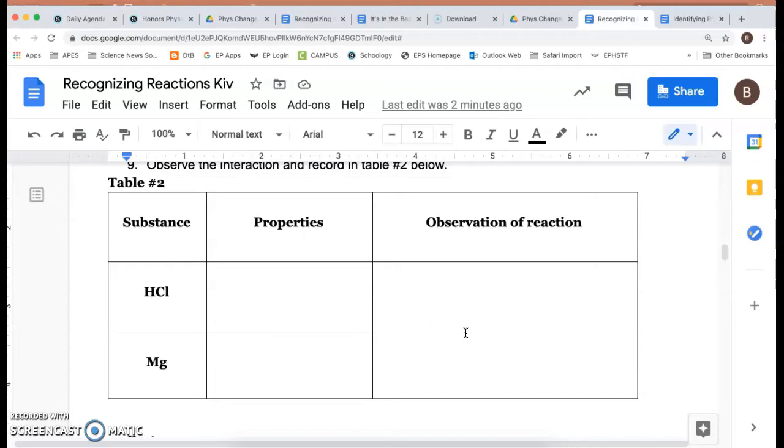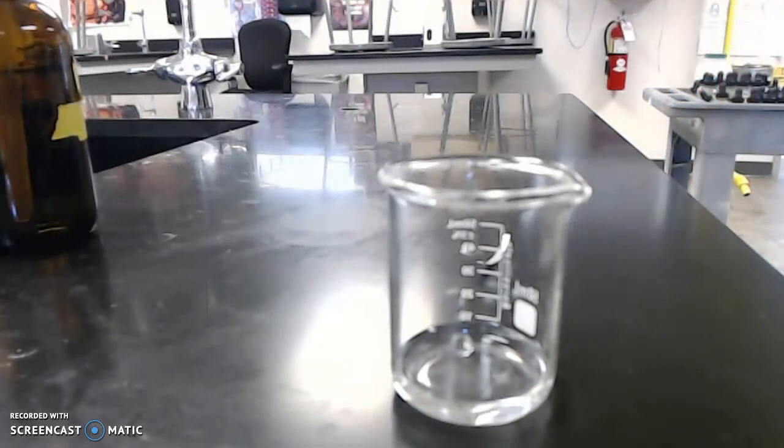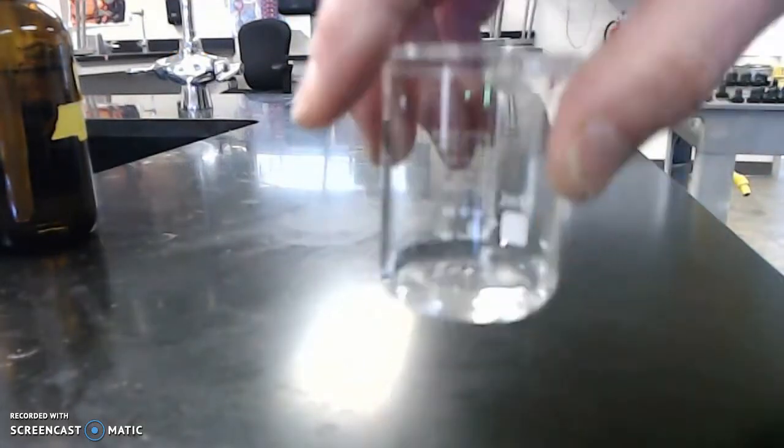So first of all, I'm going to take some hydrochloric acid and put it in this little itty-bitty tiny beaker. And why am I using the dropper bottle when I can just simply pour it out? And that should be sufficient hydrochloric acid. So I'm going to bring this close to the screen and make things a little bit bigger so that we can actually see things.